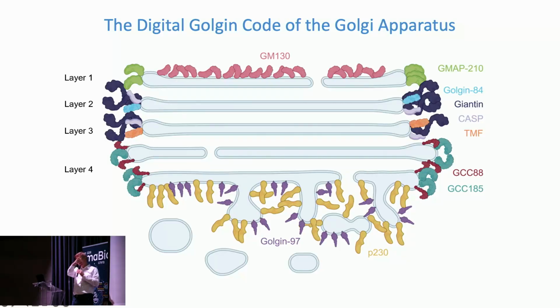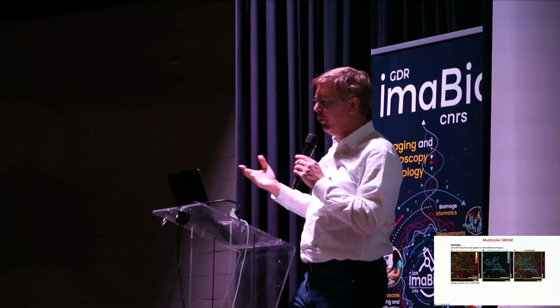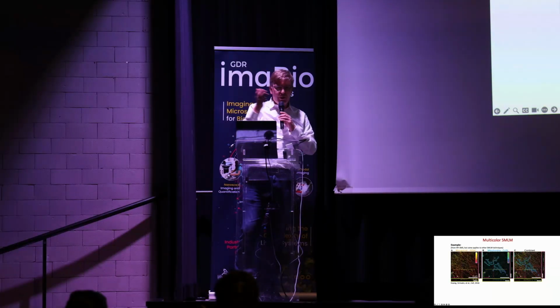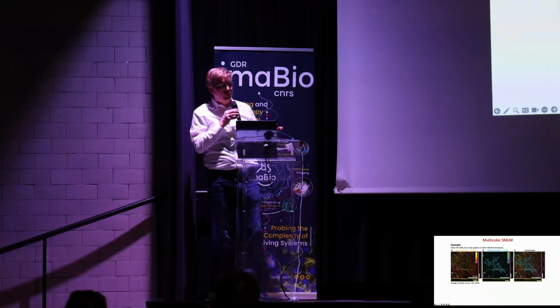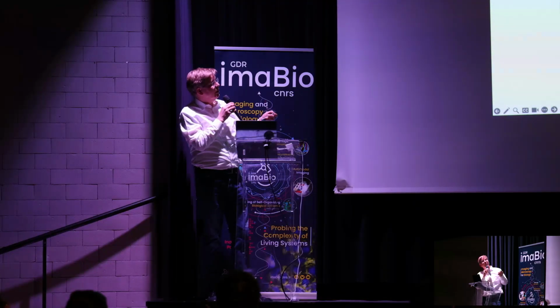So obviously the data you've seen on the last few slides was already 2-color data here. And the classical way you could imagine doing this, how we would normally do it on any confocal microscope, is you take a far red dye, you take an orange or red dye, and you image them in different color channels. This has a couple of issues though, and there are better approaches, I think, in the single molecule localization field. But this is the traditional approach, right?